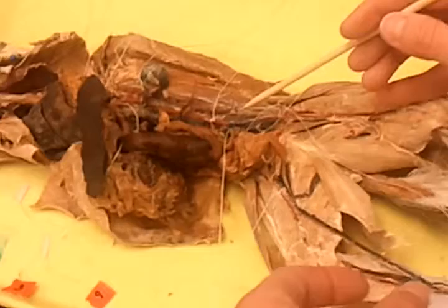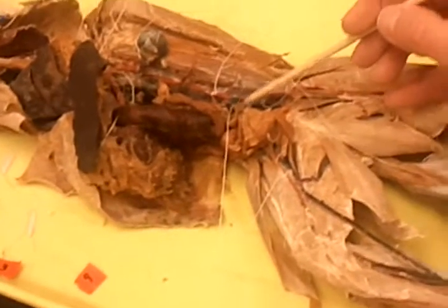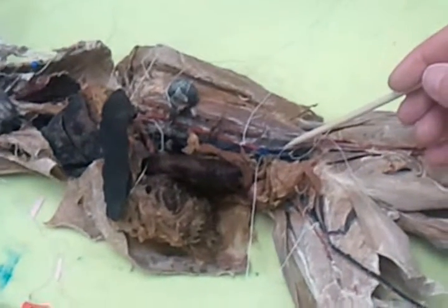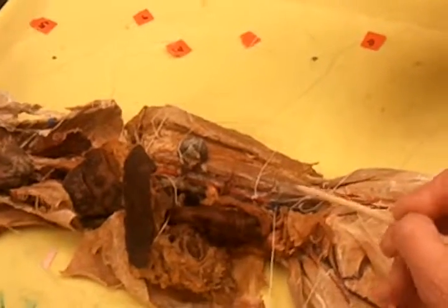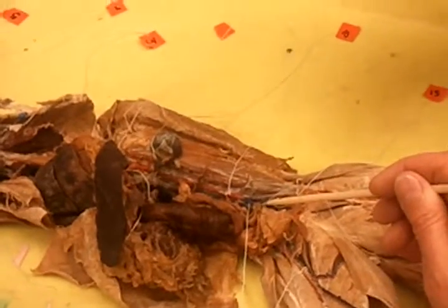Okay, so this is where cat is a little different from the human. This first split forms what's called the external iliac artery. This one coming more medially, you can see this is actually just a little extension of the descending abdominal aorta, and then it splits. These are the internal iliac arteries. Where was the external? The external is just this first split coming off. Okay. And then the internal would be these guys coming off.